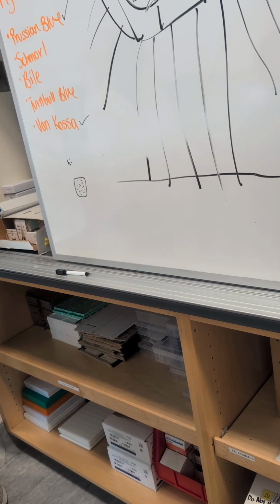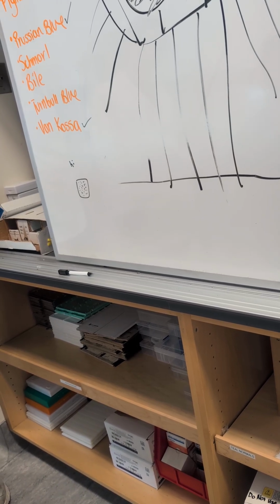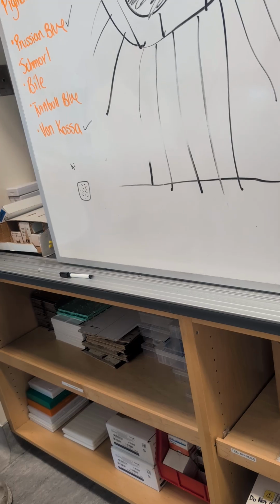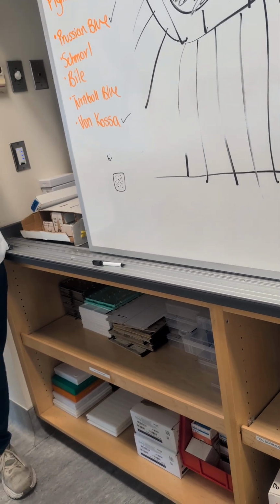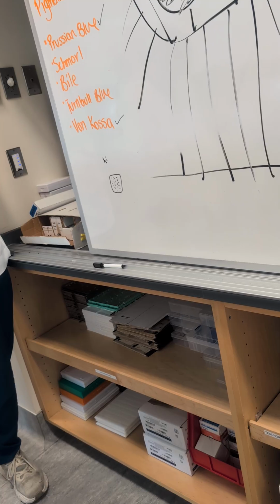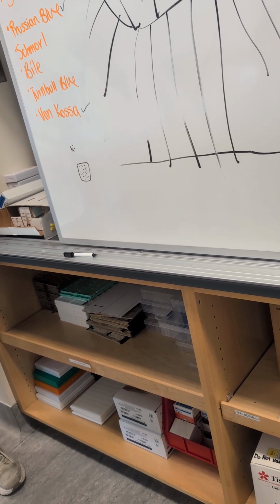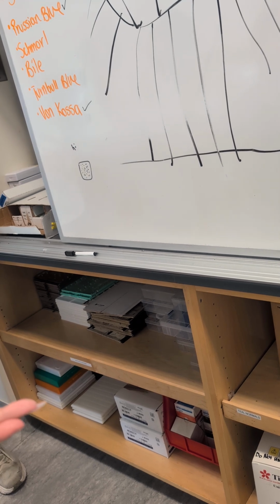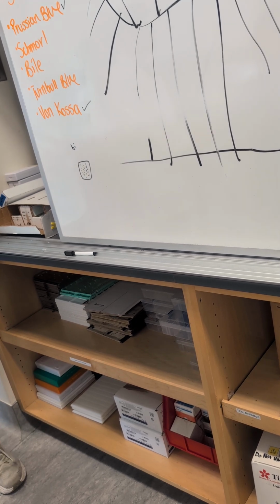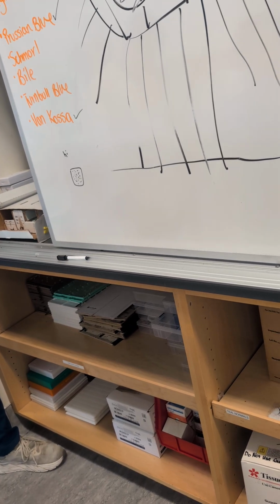If we get a POC, it's more of a clump of tissue than typically an actual fetus. So it's a clump of several different types of tissue. There's no way to distinguish between them all, since you could if you process it, cut it and stain it, but most of the time you're not involved with that. Okay, our time's done, so I'm going to take that out.